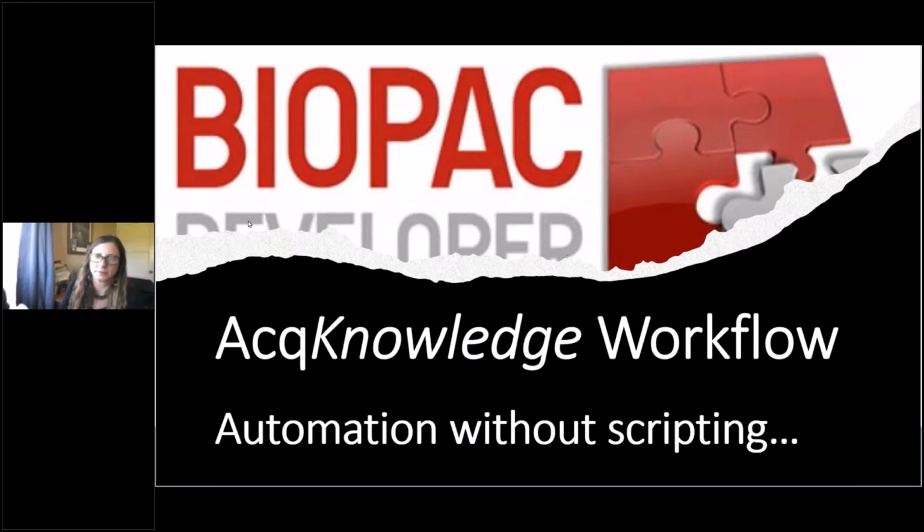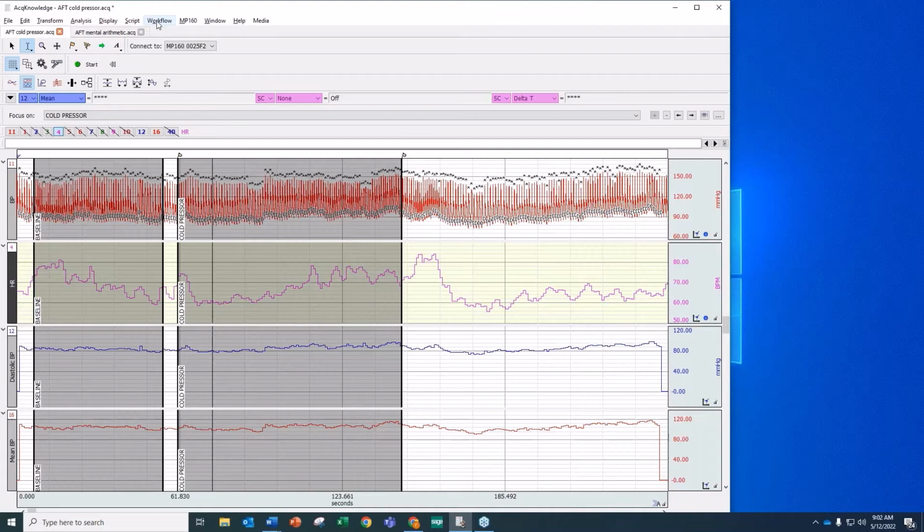Yep. Okay. So as I mentioned and just gave you a quick demonstration, this is an advancement or automation feature that allows you to automate a lot of the analyses and create custom analyses and batch processing of your data without actually having to write your own scripts. Sort of high-level stuff. This allows those people that don't want to necessarily write their own scripts to automate things in the same way. You can do that using workflow, or you'll be able to do that using workflow.